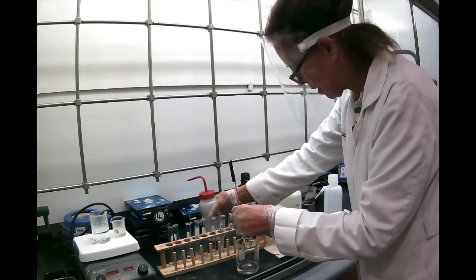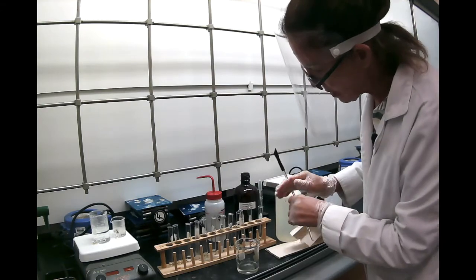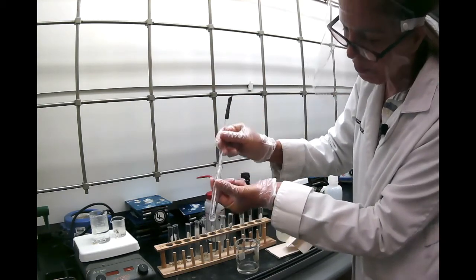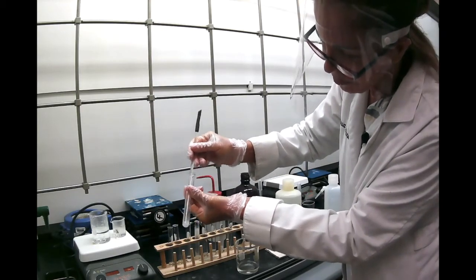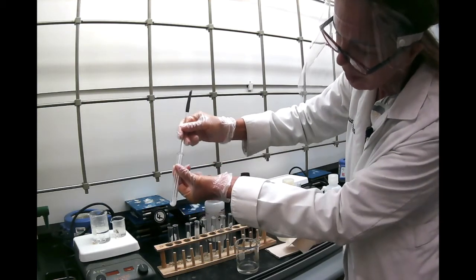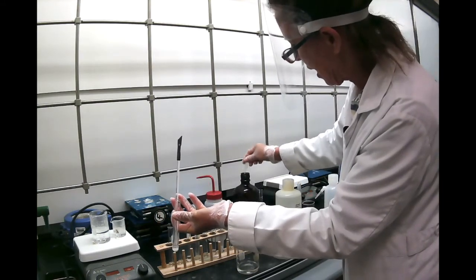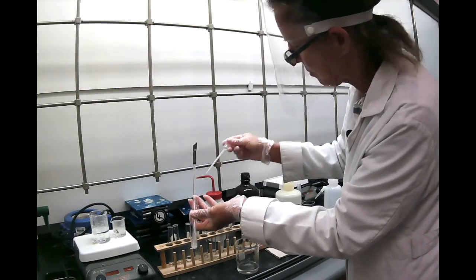Then we're going to look at benzoic acid. Benzoic acid right here with petroleum ether. And it really doesn't look like it's dissolving at all. You can see it's kind of a whitish thing. Every time I need to heat it, I'm going to add a little bit more because it evaporates very quickly.